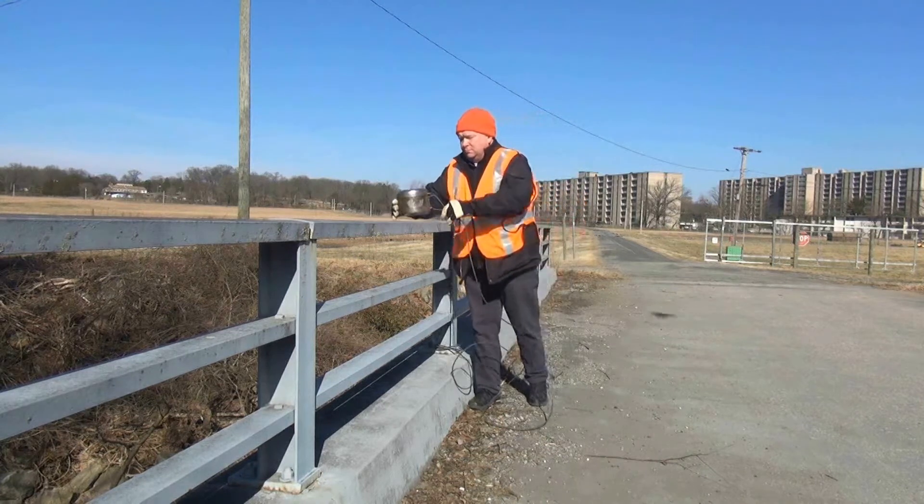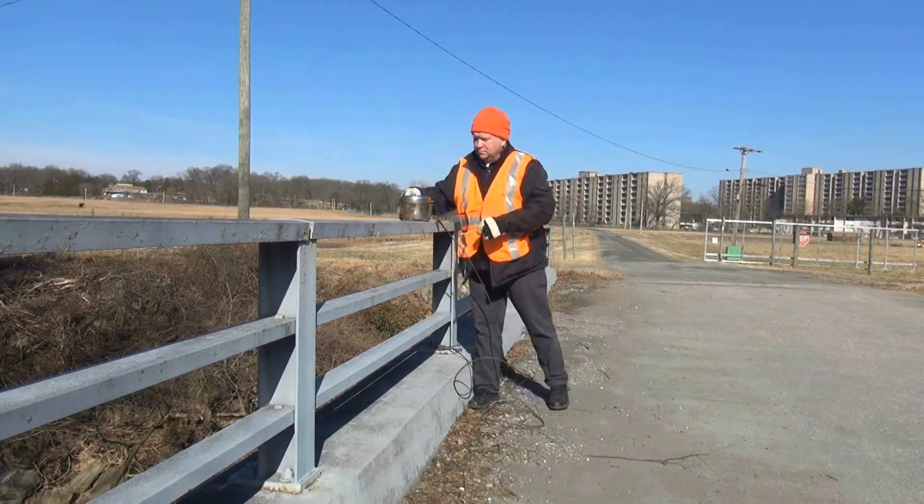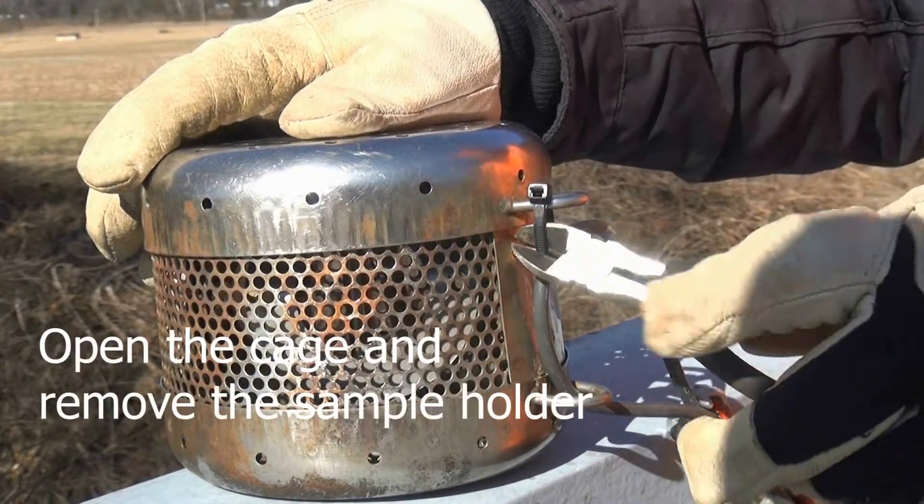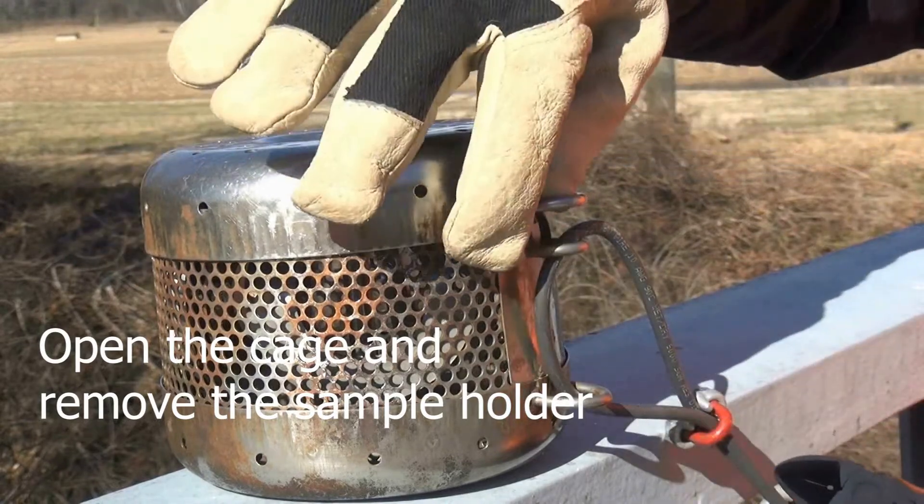Place the retrieved cage on a stable, level surface. Open the cage by cutting the zip tie that secures the top and unscrewing the top.